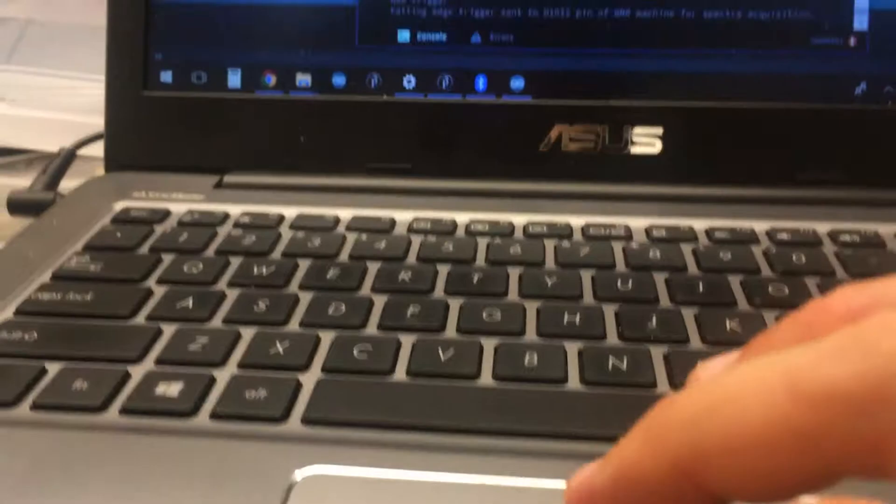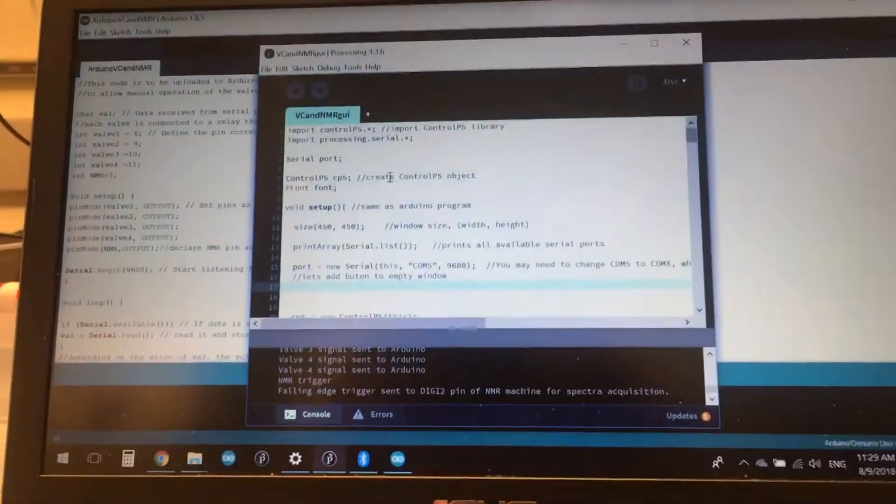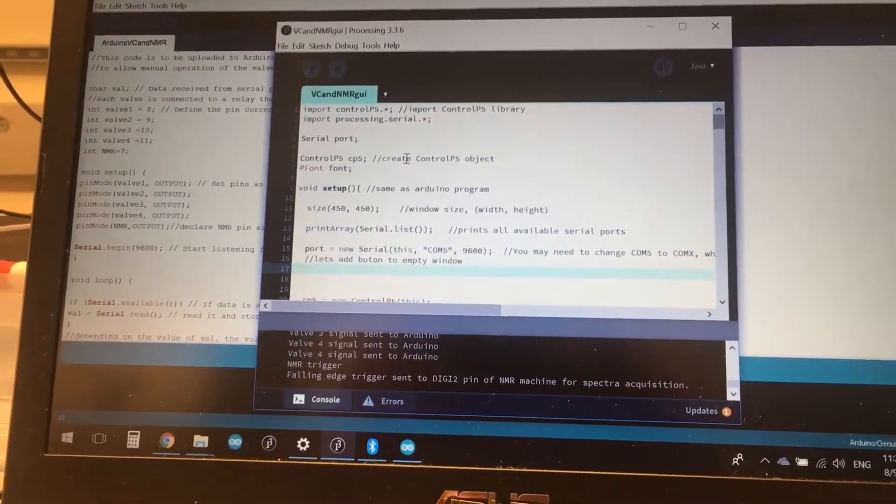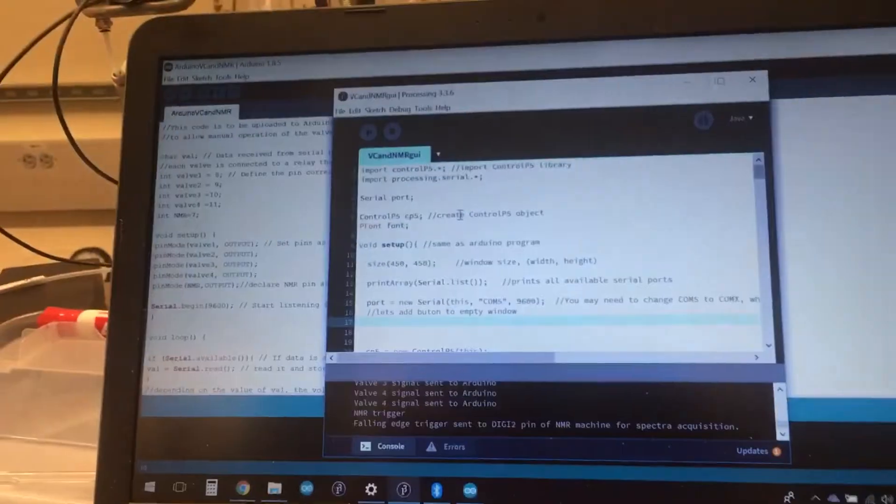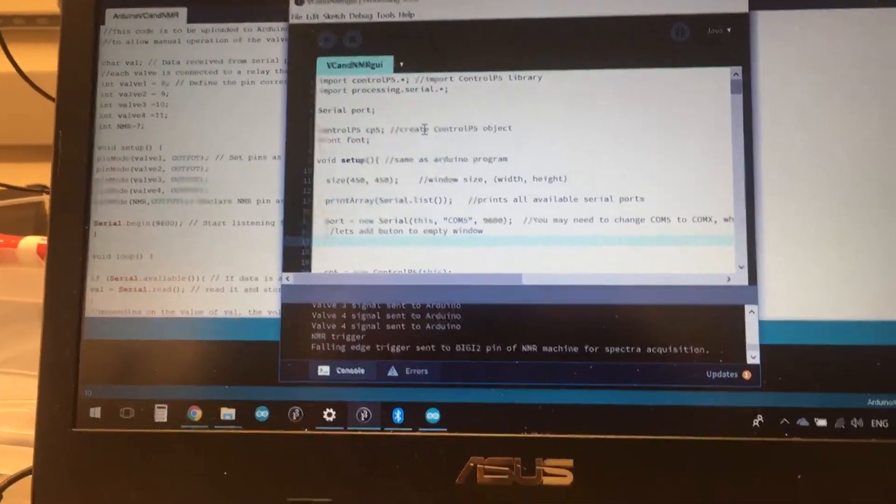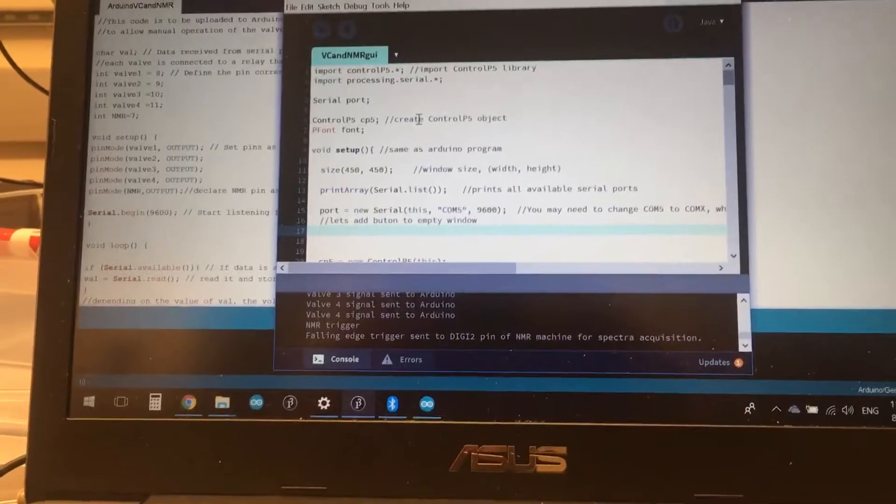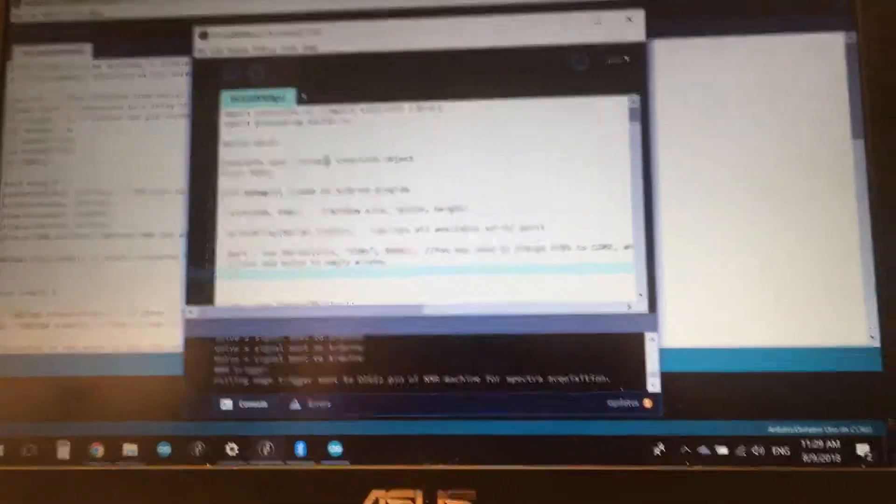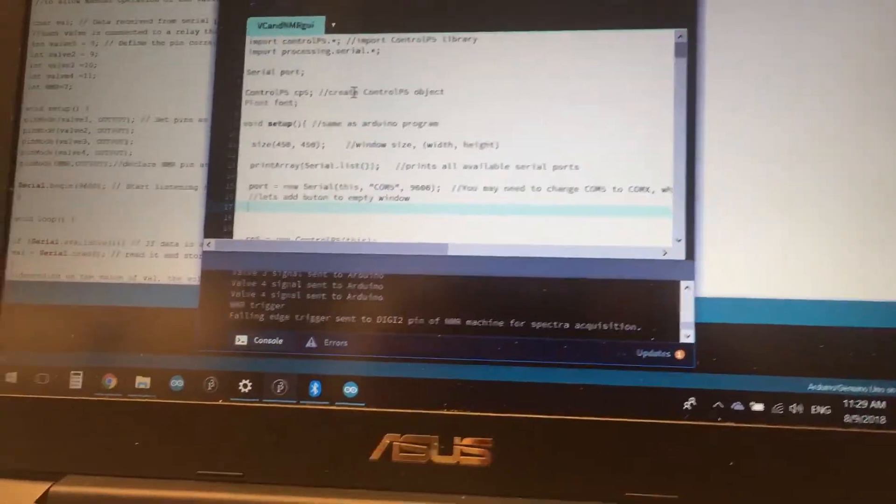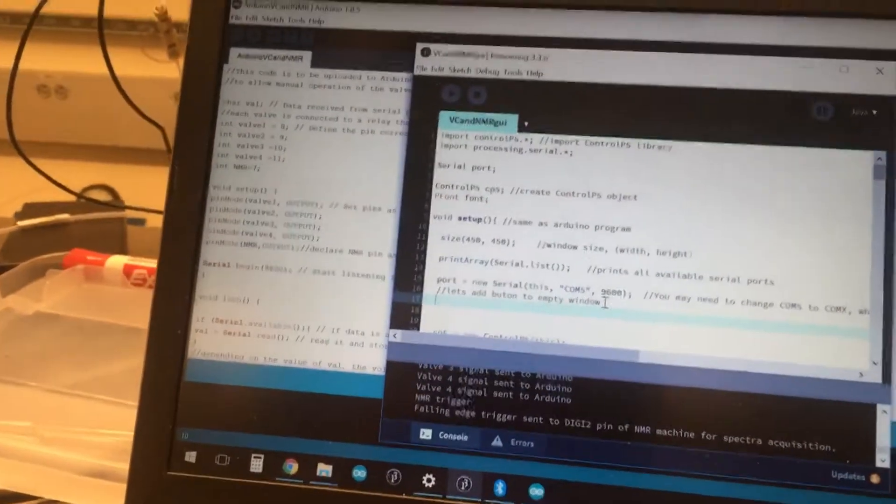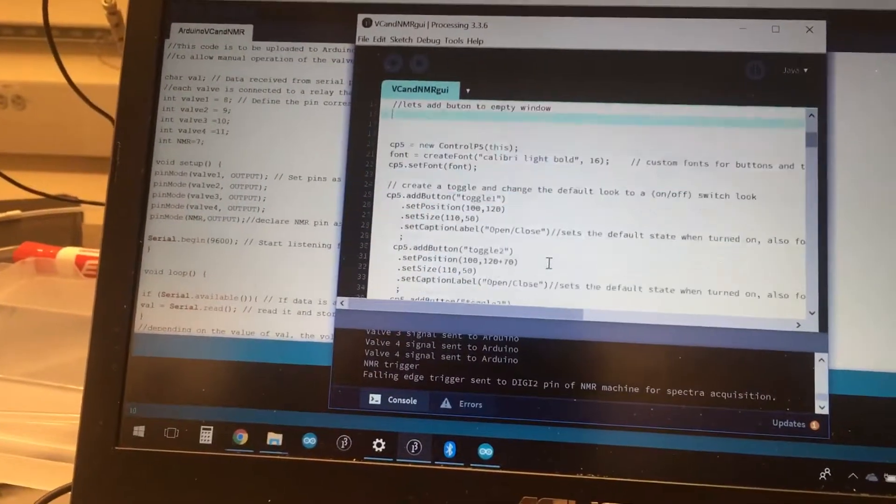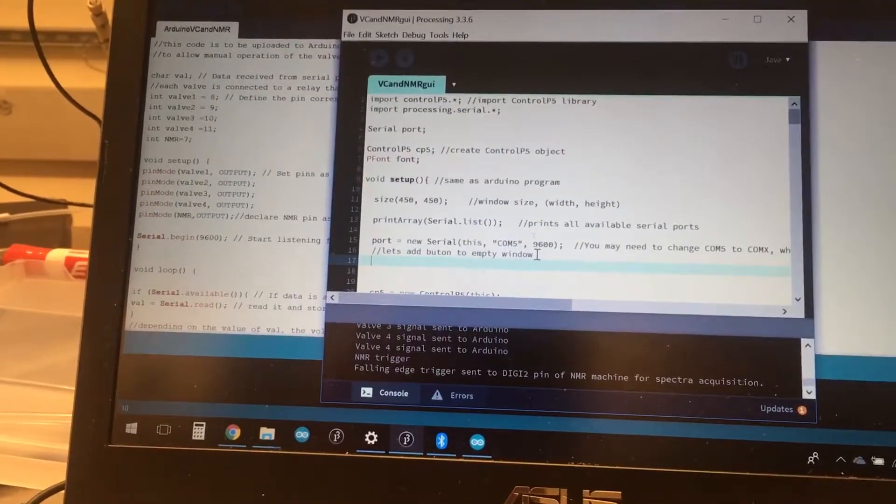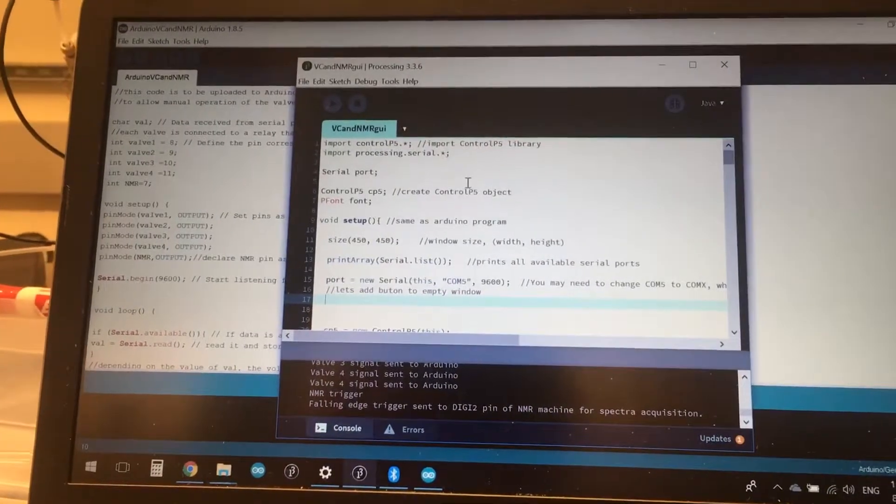The way to run this code is to pair the Bluetooth device to the laptop, because the laptop has built-in Bluetooth. In this case, the outgoing Bluetooth port is COM5, and then we set the baud rate to 9600, which is the default. The processing code creates a very nice GUI using the Control-P5 library.